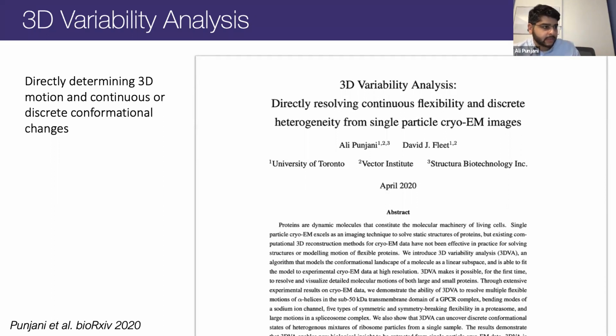The actual algorithm itself is described in a lot of detail in the paper, as well as a lot of the prior work that has come in this field. Lots of different people have been working in the field of continuous flexibility, and it's very much a difficult and open problem still. 3D variability is only a first step, and it does work very well in practice. As far as we know, it's the first method that's able to resolve high resolution motion in multiple different modes, different types of motion at the same time, and at high resolution. And it's also the first method that can work for smaller proteins, not just very large complexes like ribosomes and spliceosomes. It works for membrane proteins and small proteins as well.